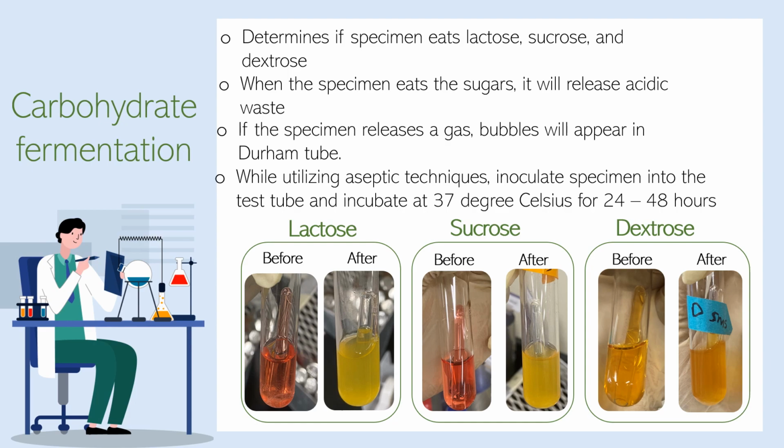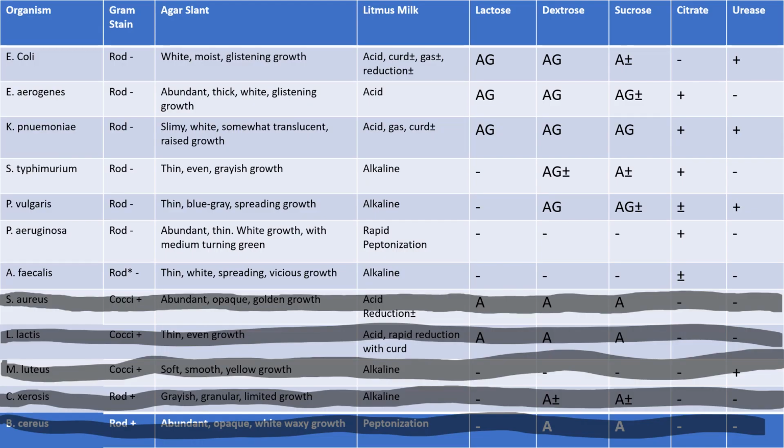This test led me to believe that my specimen is E. aerogenes, Klebsiella pneumoniae, or the possibility of E. coli.